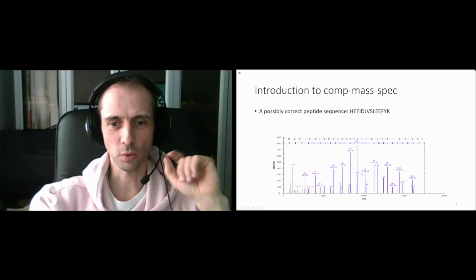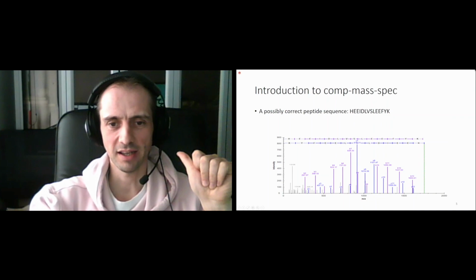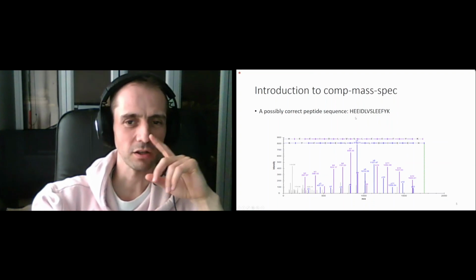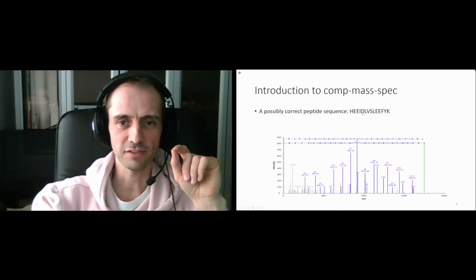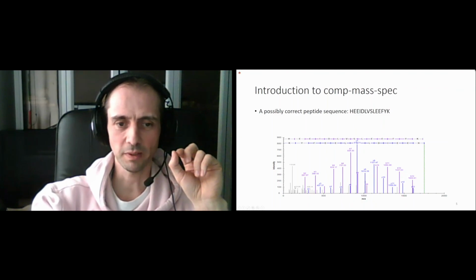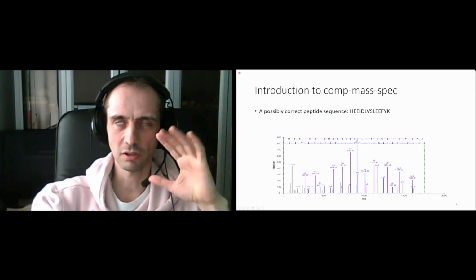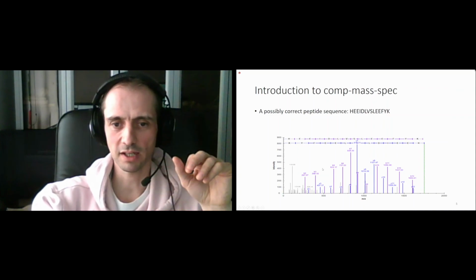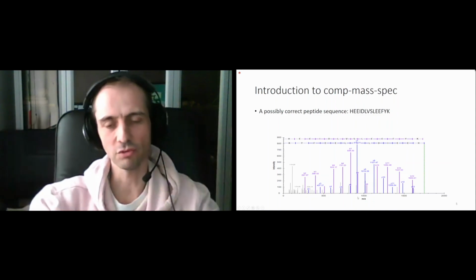So this is one experimental spectrum, and this experimental spectrum is all the peaks here. You observe all the peaks, and you have to assign each peak to one of the two molecules. That's your task. No. Here I have this molecule, and this is a fragmentation of the molecule. Okay, this is not hertz. So it's basically the distribution of the masses of the fragments of this molecule. You break this molecule, and then you get these fragments and you observe the distribution, let's say.